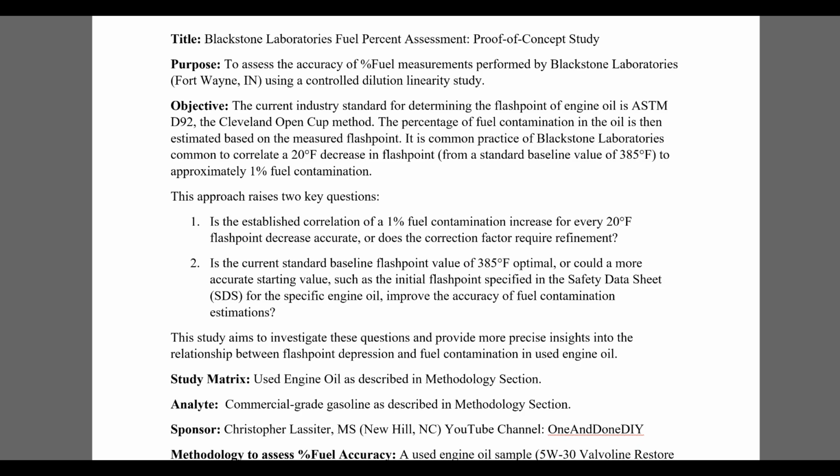So the first thing I want to talk about, what is the motivation behind this? Well, a lot of people, we had discussions about the fuel dilutions, because I mentioned that a few times in some of my oil analysis with the restore and protect. And a lot of people were questioning the accuracy of Blackstone's methodology of how they determine fuel percentages. And also some other people saying, oh, well, if you send it over here to this other company that does FTIR, you get a completely different number, like 3 times different. And FTIR is the way to go, so on and so forth.